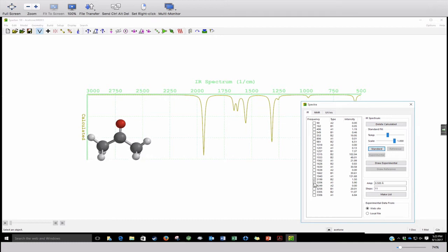If we look at the one at 3206, it's a little different type of hydrogen stretching. 3249. Okay, there are all kinds of possibilities for stretching those hydrogens. They're not all the same type of stretch. And so it can get quite complicated, actually. Okay, kind of funny, right? Looking at all these little stretches.